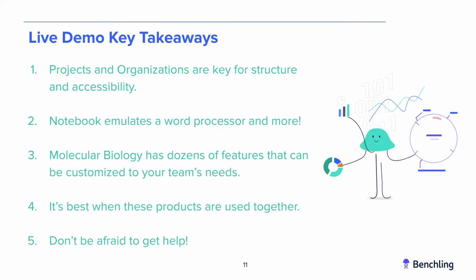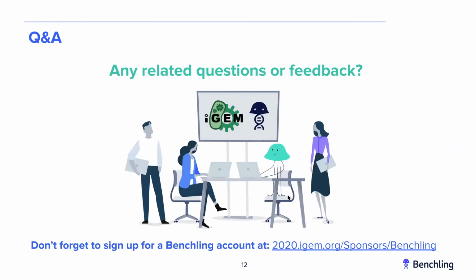All right, so I just wanna open it up to some Q&A time. I know we definitely have a lot of great questions. So what we'll do now is we'll try to read off a few of these, and either Madeline or I will field them. I'll start with one. Does CRISPR specifically refer to genome editing? Is there a tool for designing single guide RNAs for CRISPR interference?